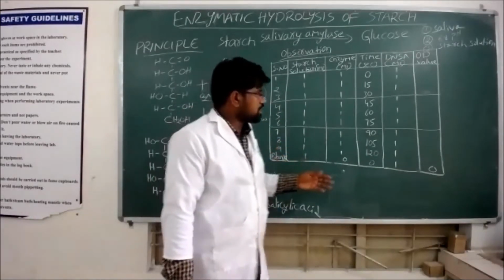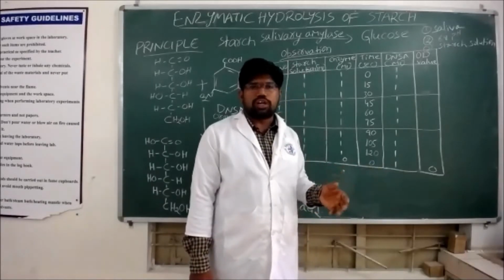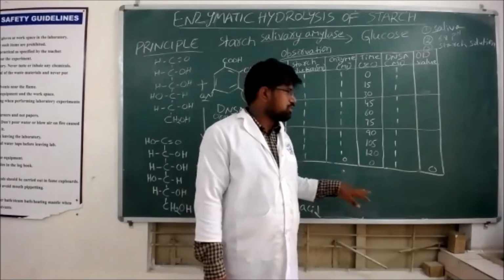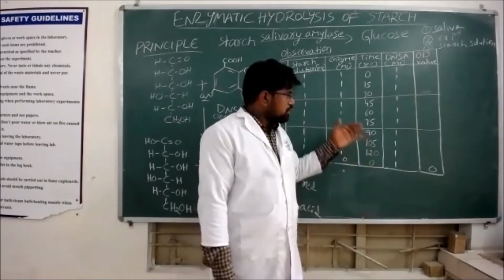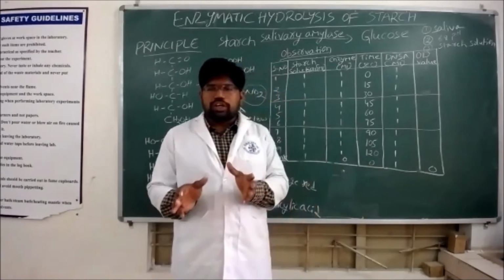After adding DNS, incubate at room temperature for 5 minutes and boil on the water bath for 2 to 3 minutes. Then measure the absorbance of the tubes against the blank at 540 nanometers. So very simple experiment.